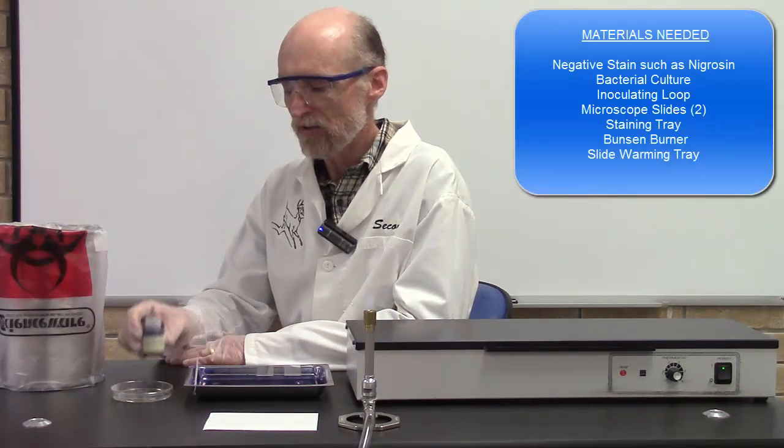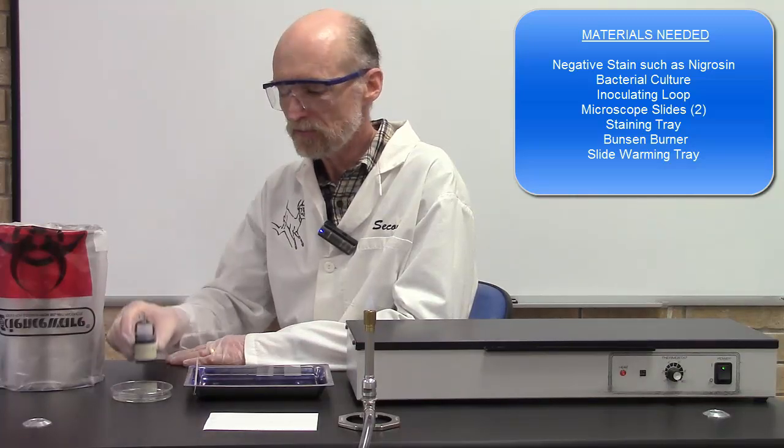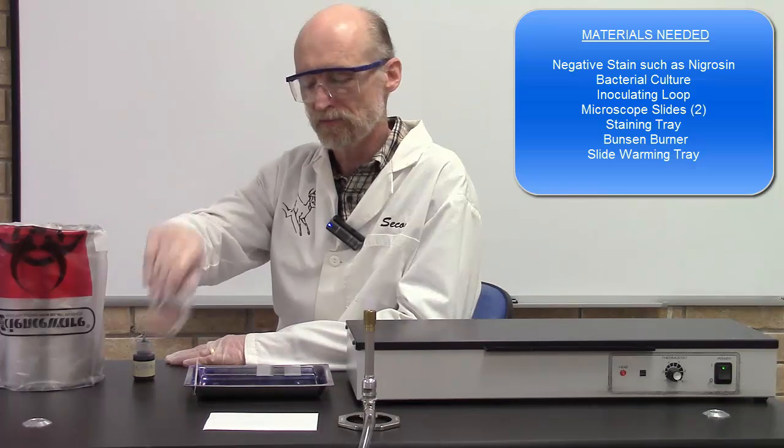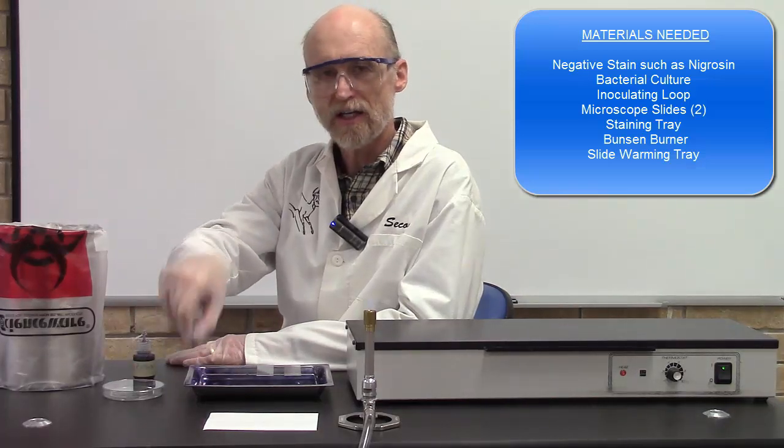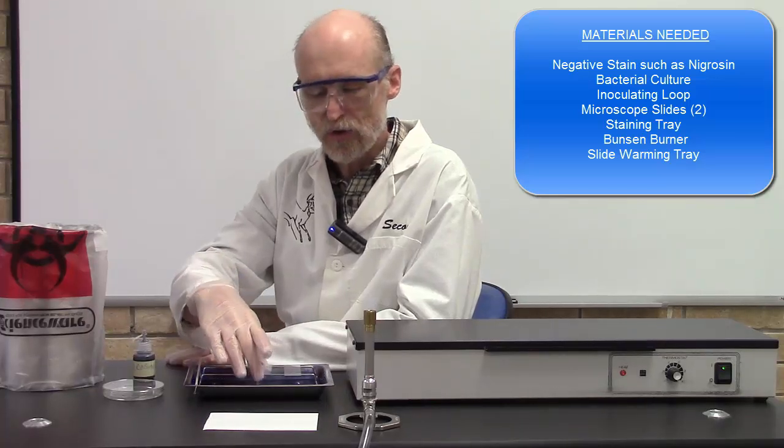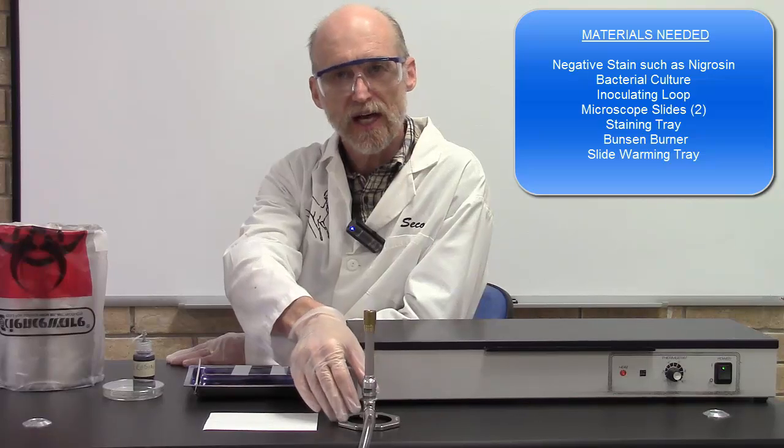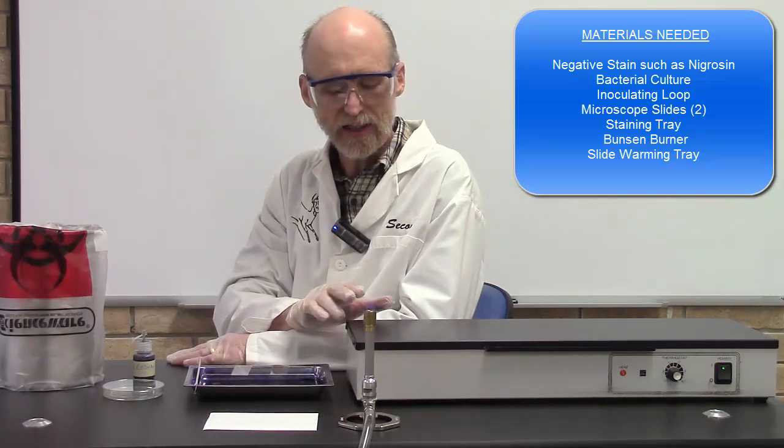You'll need a bottle of negatively charged stain. I'm using nigrosin. You'll need a bacterial culture, an inoculating loop, a staining tray, two microscope slides, a heat source to sterilize your loop, and finally, a slide warmer.